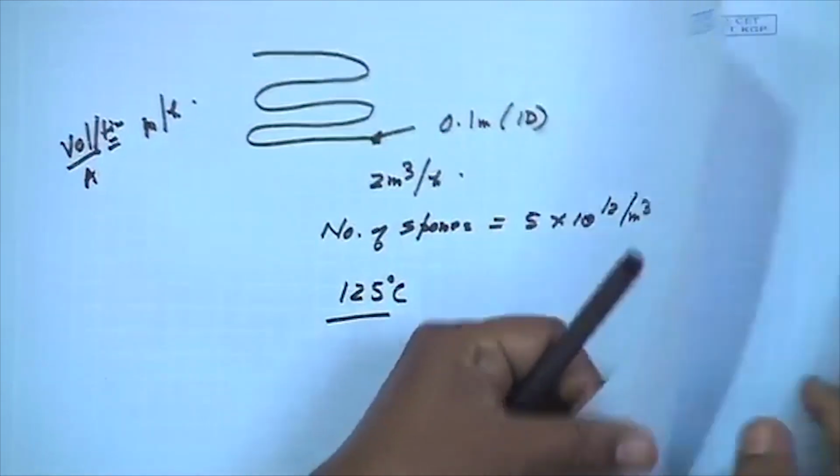Now let me show you how we can transfer the culture, because now we have the information on how media can be sterilized and how air can be sterilized. What remains is the culture we prepare in the lab, which has to be aseptically transferred to the inoculum vessel.